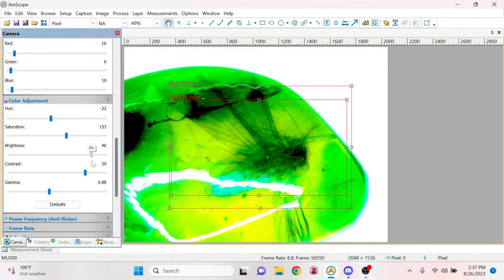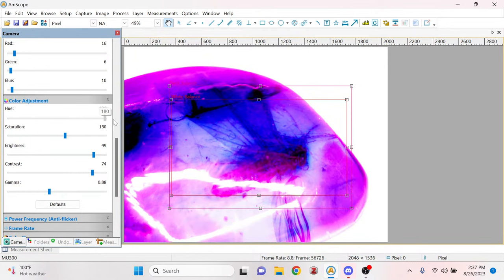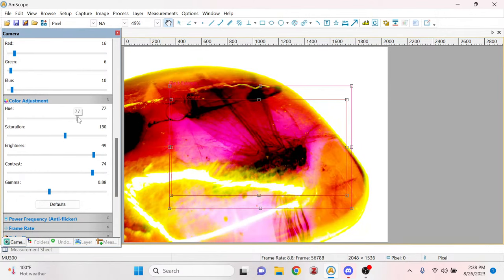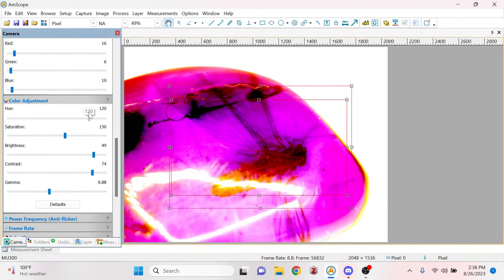So yeah, this is called an Amscope FMA050. It's not a fancy schmancy microscope or anything. It's a dissection microscope, technically. But as far as just something to have here at home, very convenient just to have on a nearby desk ready to go if I need to look at something close up.